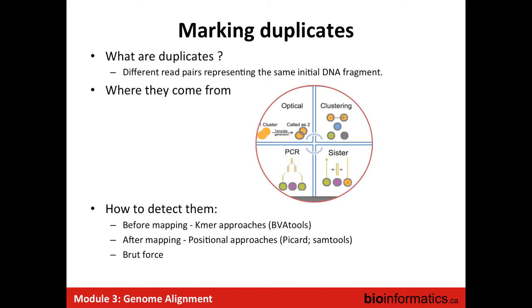Because usually, most of the time, all these sequences will have the same sequence because they are duplicates. So there's not really so much difference in between. What is different is also the size of the read, because some of them will be trimmed to a certain level and the others won't be trimmed. So that could make the difference, but you try to have the best general quality.